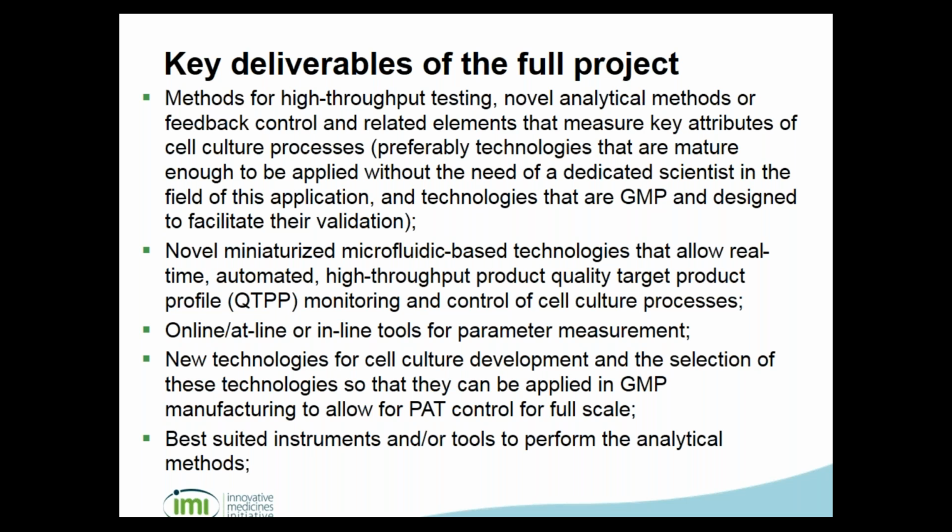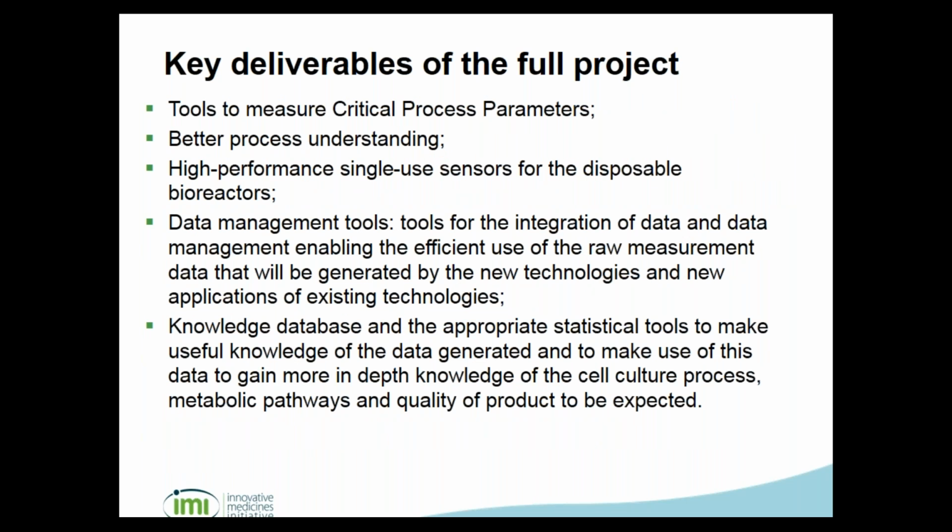New technologies, so PAT, process analytical technologies, where by testing, you can really direct your culture and you can make small changes to your culture. Of course, all this, again, we are working in a GMP environment. We are looking for best suited instruments or tools to perform those analytical methods. Next slide.